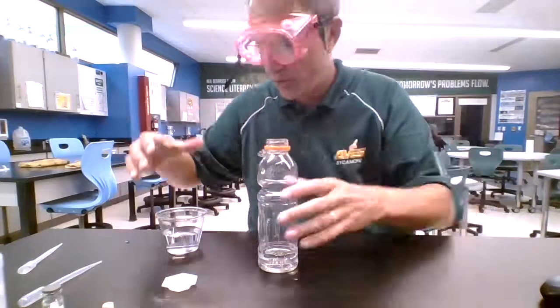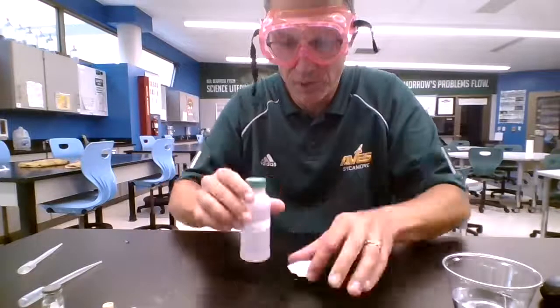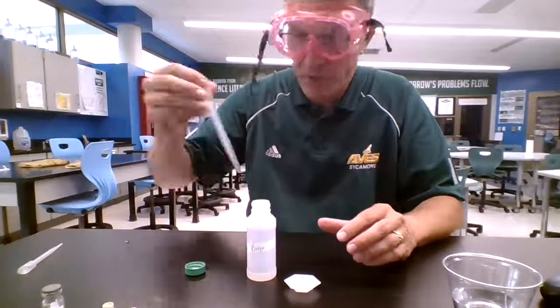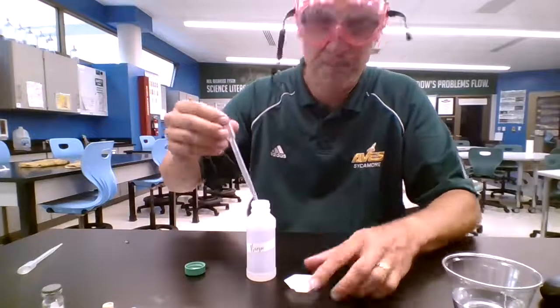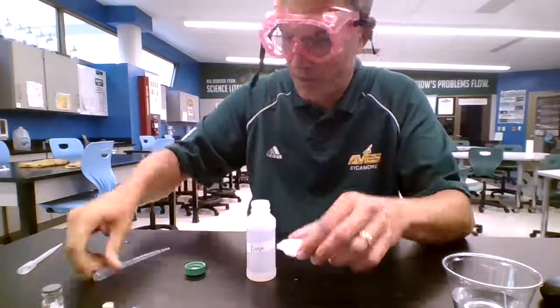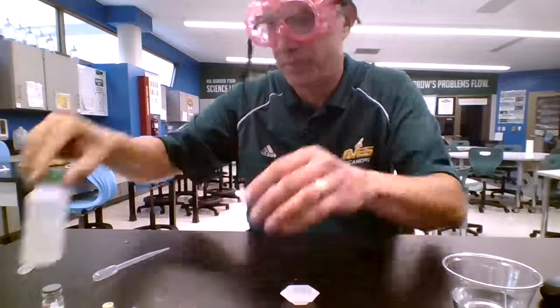Now, move this out of the way. Next thing we're going to do is to now take vinegar in our small little weighing dish. Open the vinegar. I want about 5 milliliters in there. And take it, fill it up, and there we go. So I'm going to drop the vinegar without getting the baking soda wet.